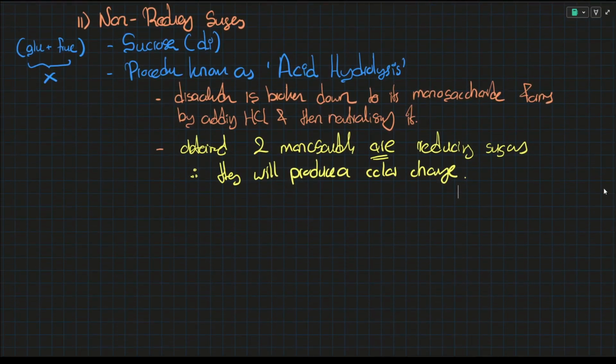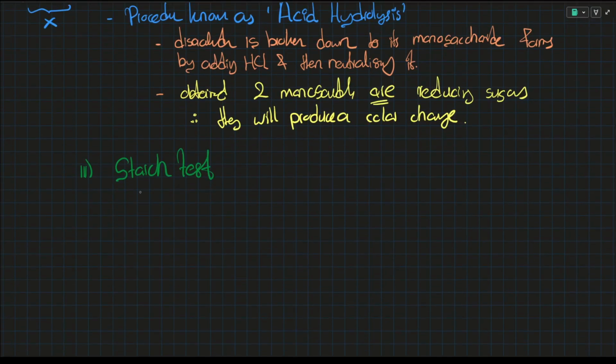Moving on to starch. This will be the third test we're going to discuss: the starch test. You have known the starch test for a long time. It's the same thing. There's no new information added to it.